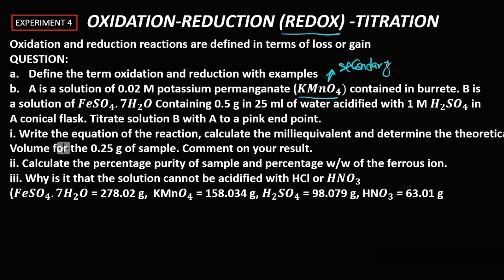Potassium permanganate is a what? A secondary standard. Are you getting it? It's a secondary standard, and because it's a secondary standard, it requires oxalic acid. Oxalic acid is a primary standard, according to what I told you. When you are given a secondary standard, what do you normally use? You use the primary standard to standardize it, right? So potassium permanganate, we need oxalic acid to standardize it.